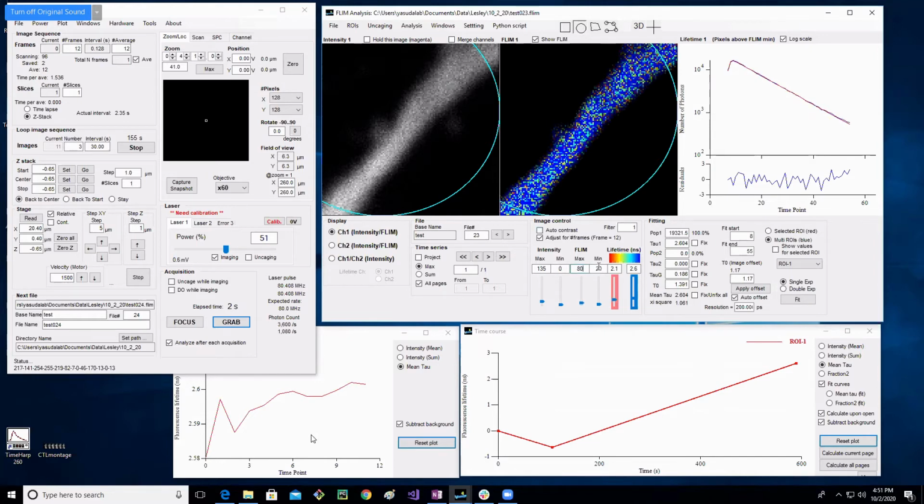You can also eyeball it and say, I think this should be a little lower because I can see a spine here and I can't really see it over here. Now I'm starting to pick up that spine a little bit. This is something you'll have to get used to. It is subjective and you might set it differently than I would, but as long as you're consistent throughout your whole image series, it's not a big deal.